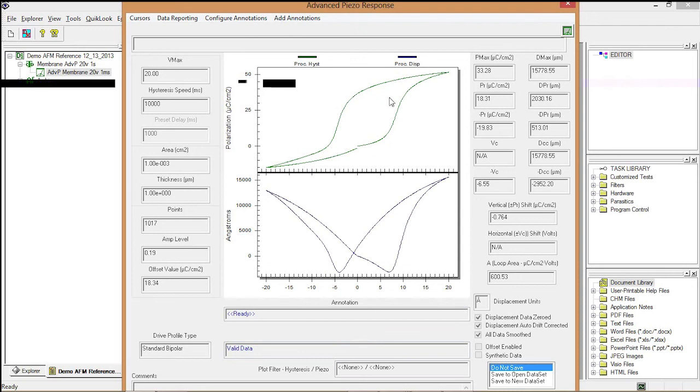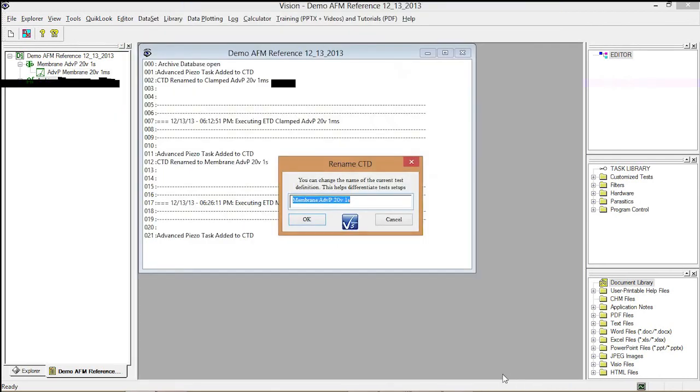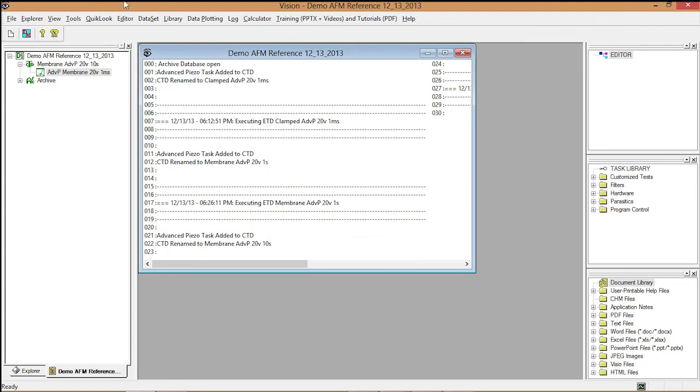We have a result. The membrane has a very nice polarization loop even at 10 seconds, and a very clean butterfly loop. I save this to the data set as a 10 second record. I now have three measurements completed: a thin film moving only about 8 or 9 angstroms, a membrane moving about 1.5 microns in one second, and the same membrane moving a similar distance over 10 seconds.